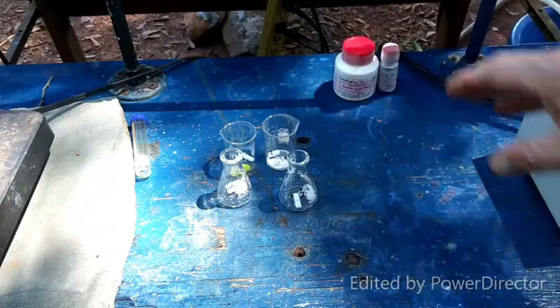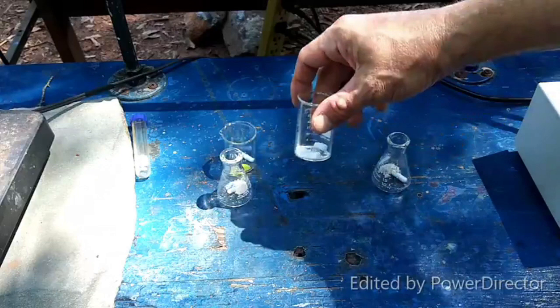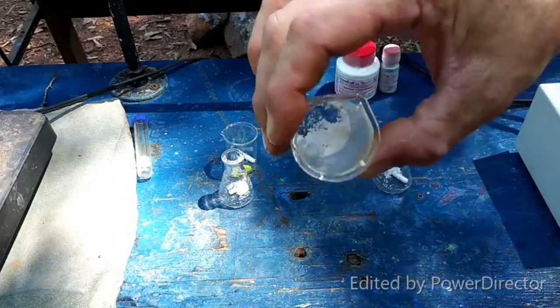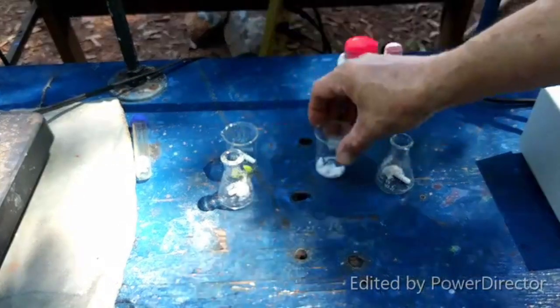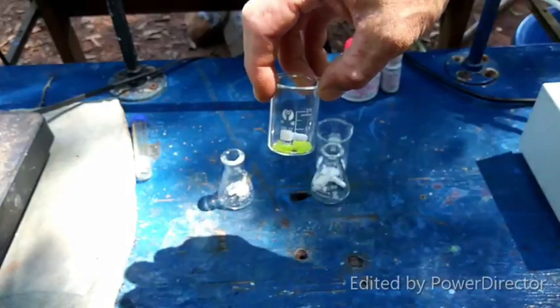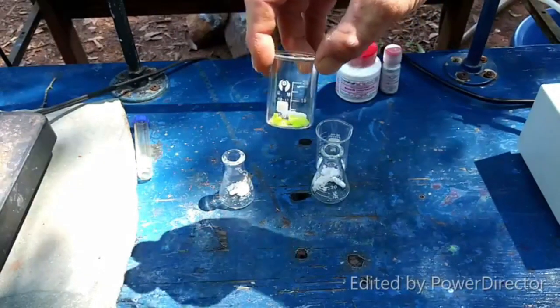Anywho, so here is the experiment. What we have here is the cesium sulfate. I know, there really isn't much to see. I'd say it's more impressive than just looking at a bottle, but yeah, it's just a white powder. Barium thiocyanate, also a white powder. Uranyl sulfate, which you've all seen before. It's kind of a nice yellowish, greenish color.